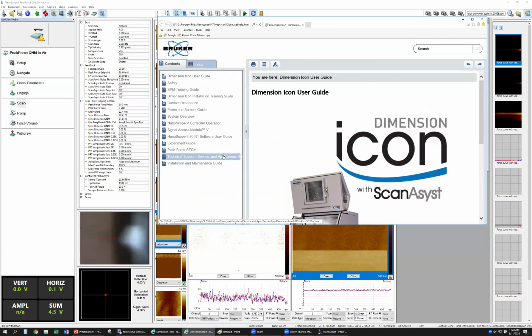Well, no, the website is internet. Yeah, internet. Because we don't know your samples. How about the Young's modulus for your sample, right? So that's why you should get some data from the website, maybe a book or something, it doesn't matter. You get the value. Then that's not correct, right? That's not accurate. It's only the range.